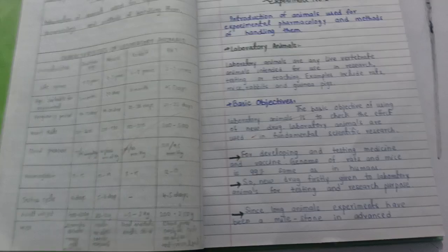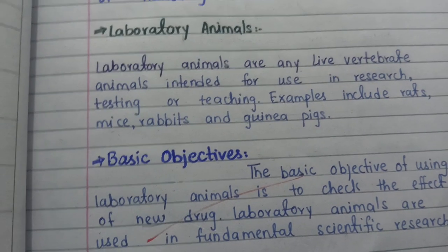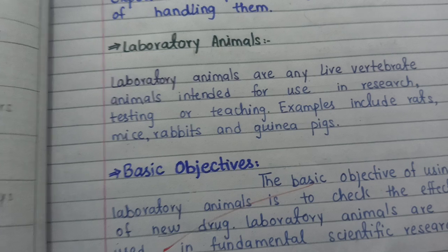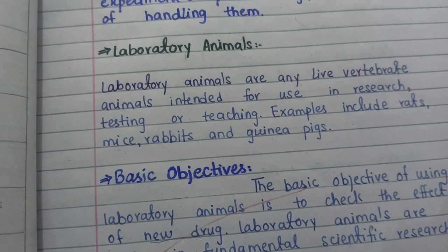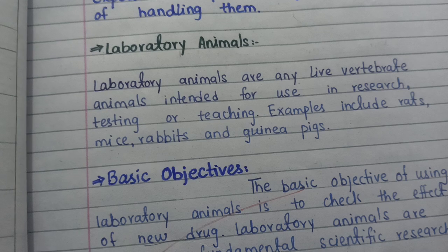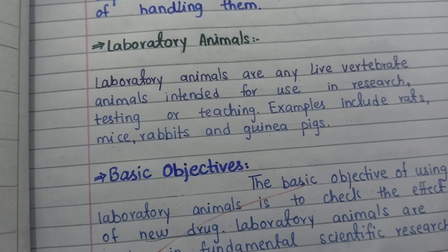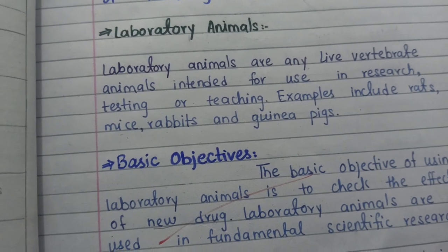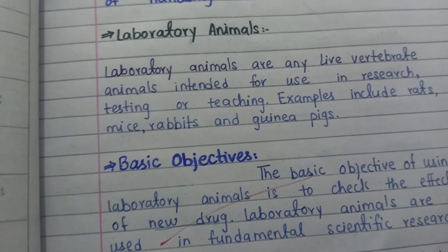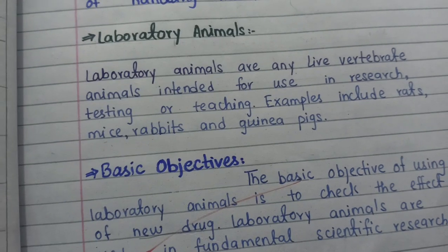So what is this very basic experiment? First you will discuss what laboratory animals are. So you know everything about the animal. These are those animals which we use in the laboratory. And why do we use animals in the laboratory? The same answer is that we use a lot of animals for research purposes. Actually, the organs and the systems inside the animals are exactly the same as the human has. That's why we use them.